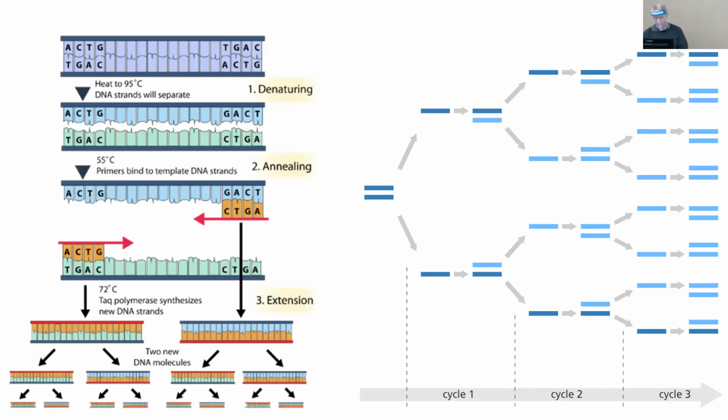So this is kind of what we're looking at with the cycler. We heat the first strand of DNA, which we disrupt at 95 degrees Celsius. Then we do the annealing at 55 degrees Celsius, where we combine these short strands to the first strand. And then we go into polymerase synthesis, where we get new strands to extend those. So you see the first cycle splits into two, the second cycle splits into two, the third cycle splits into two, if you want to keep doubling it out exponentially.